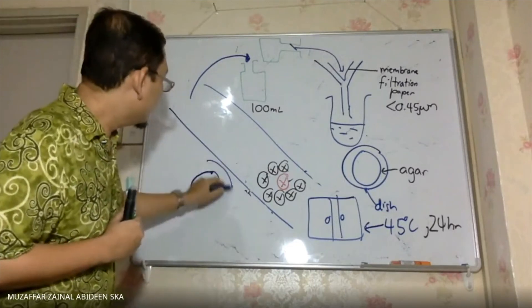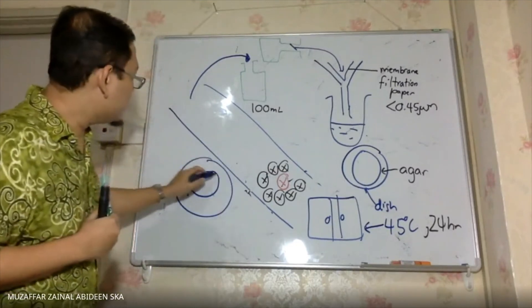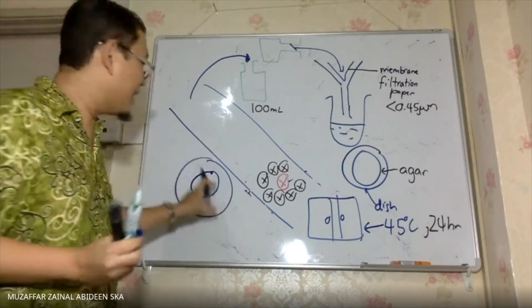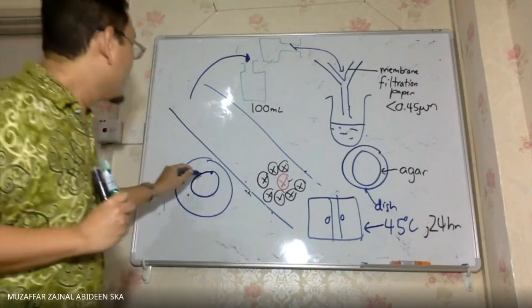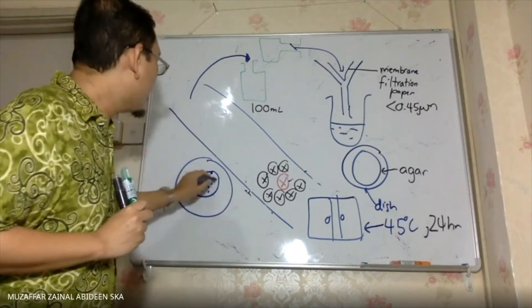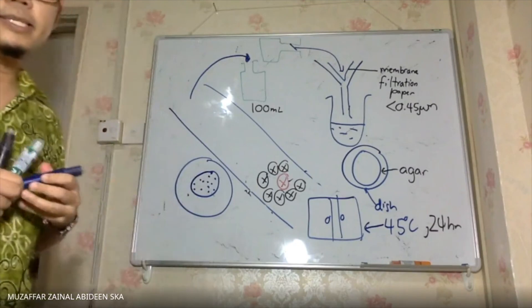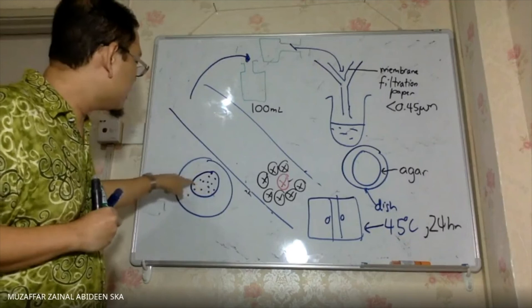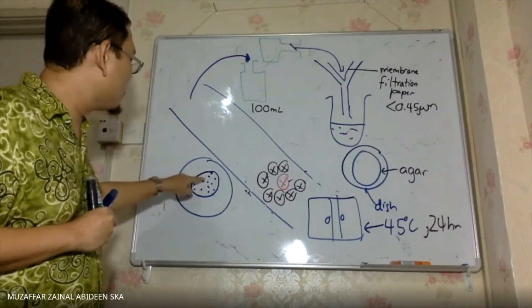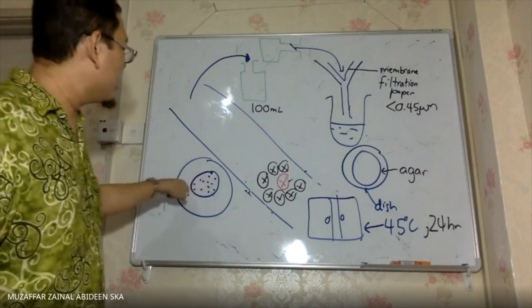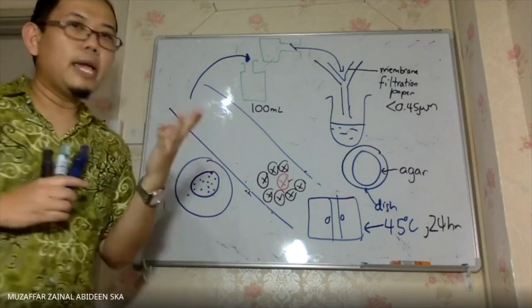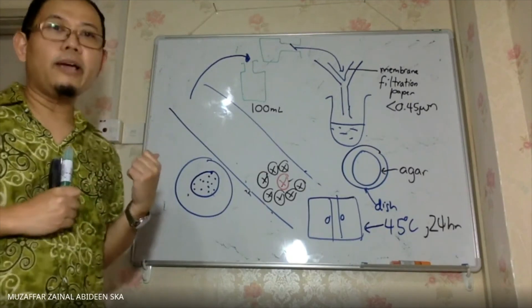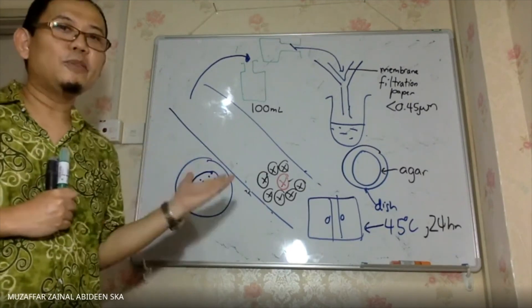After 24 hours, take the dish out of the incubator. The membrane paper stays the same size, but you will be able to see colonies on it. You must count the number of colonies present on the paper. For example: one, two, three, four — you count every colony visible.